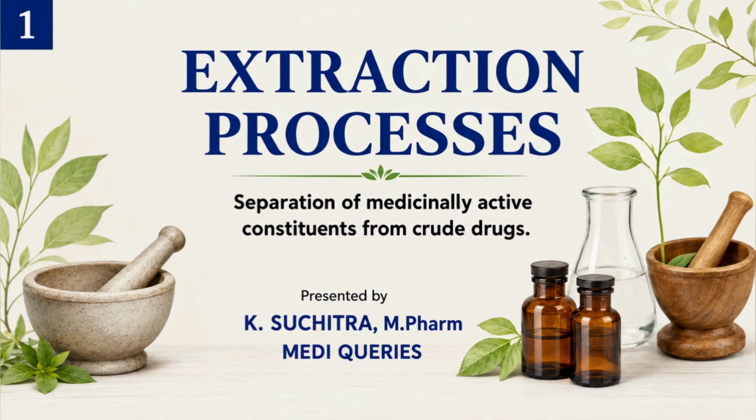By the end of this presentation, you will clearly understand maceration, percolation, Soxhlet extraction, and the factors affecting the choice of extraction process. So keep one simple question in your mind. How can we remove the useful constituent and leave the unwanted material behind? So let's begin.